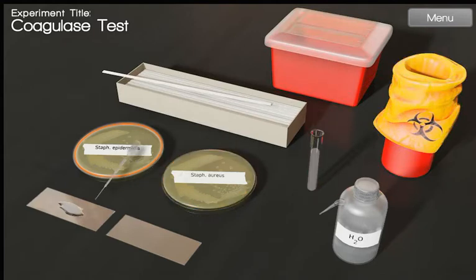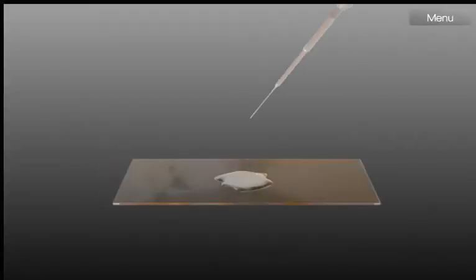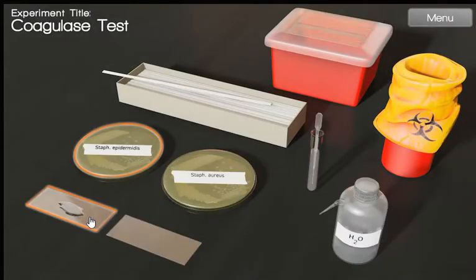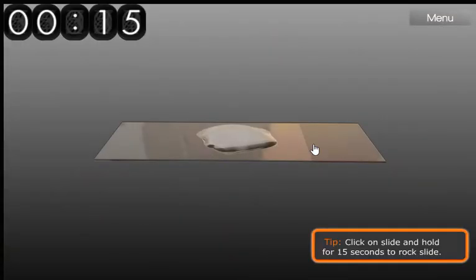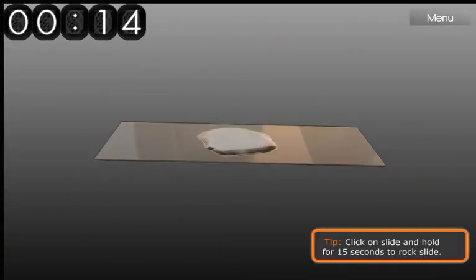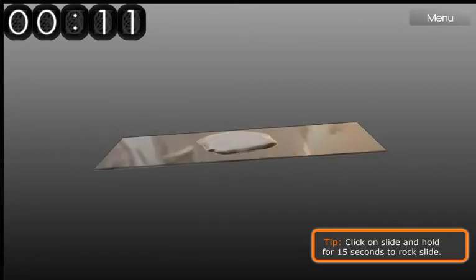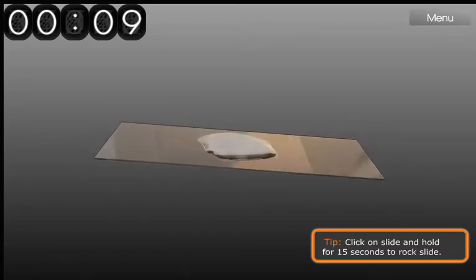We add rabbit plasma. Next we should hold and rock the slide for 15 seconds.